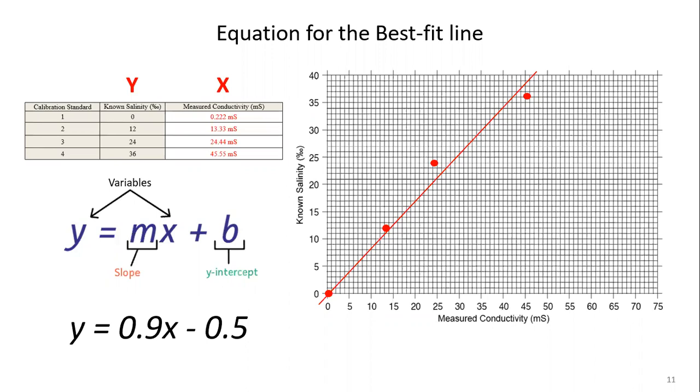Later, we will use this equation, which contains your calculated slope and estimated y-intercept, to convert measured conductivity values into salinity values.